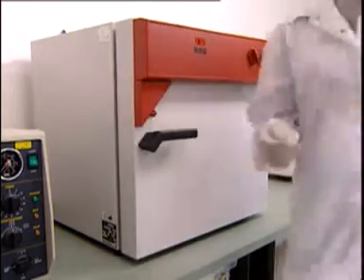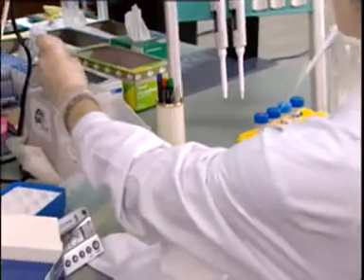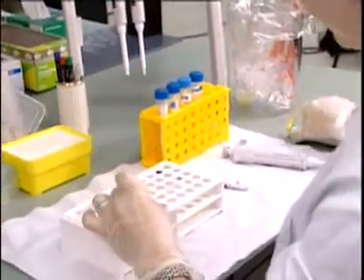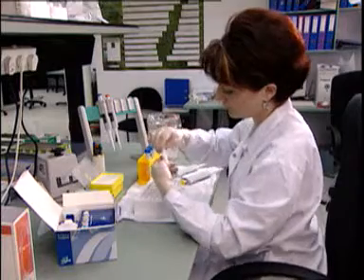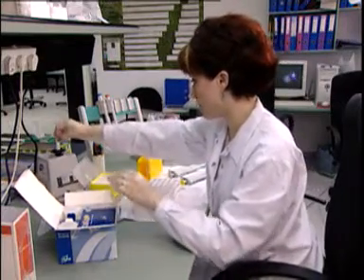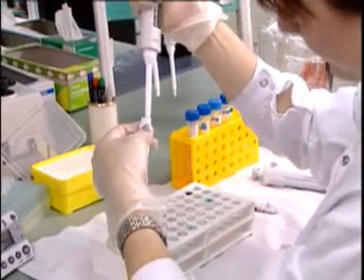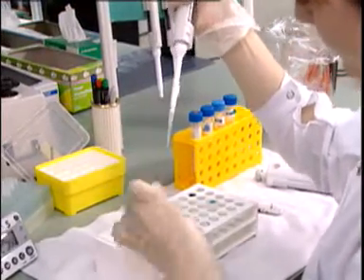When the incubation time is ended, a monoclonal antibody, specific to an antigen exposed only after the acrosome reaction occurred, is added to the cells in tube C, as well as to the sperm cells in tube B as a control. After an additional 30 minutes incubation at room temperature, the tubes are analyzed by the flow cytometer.